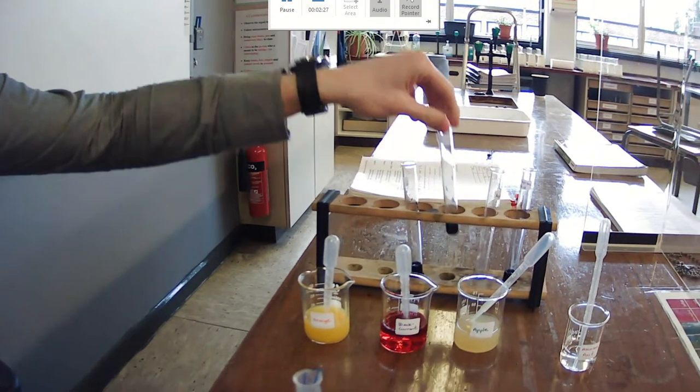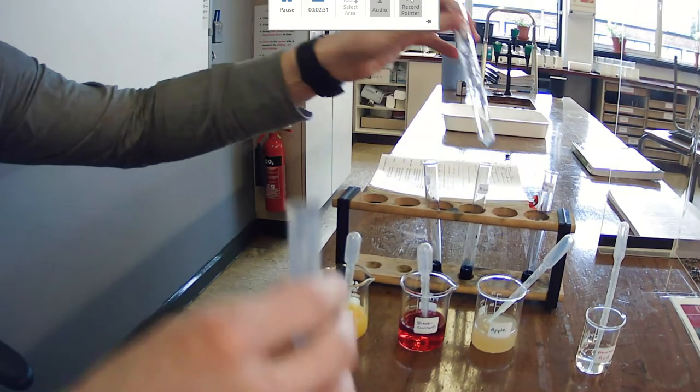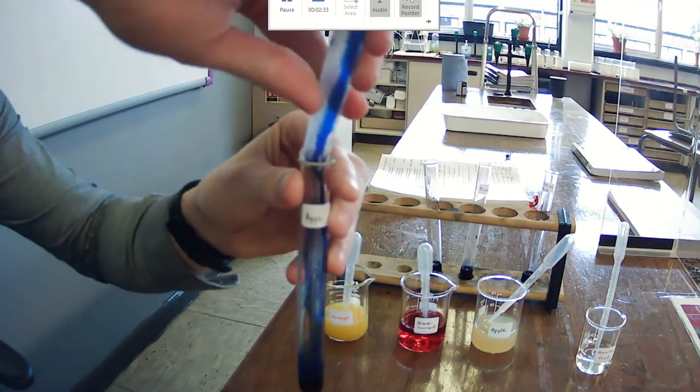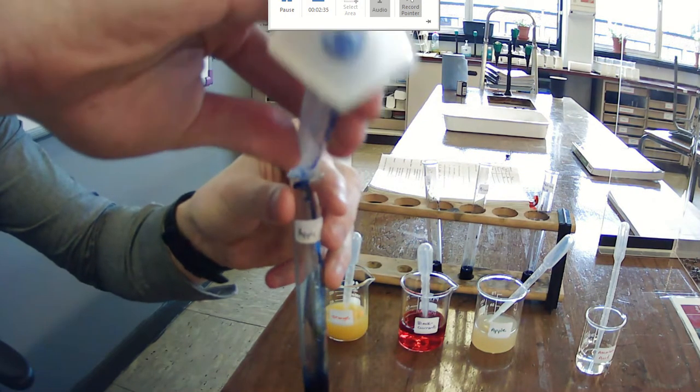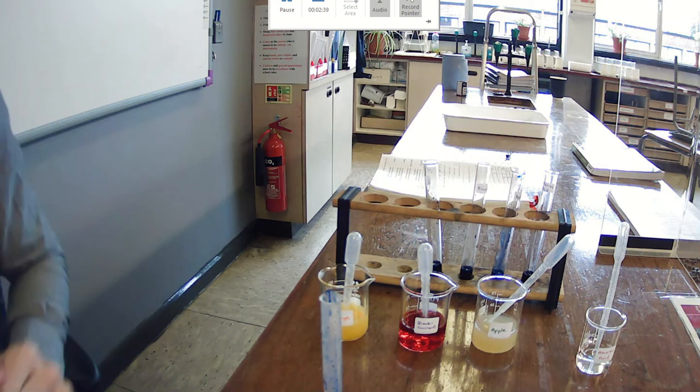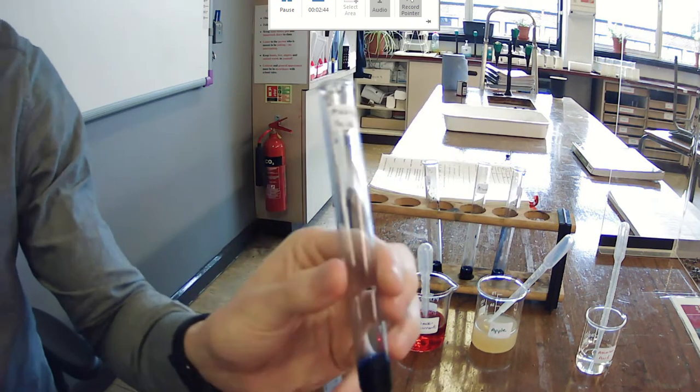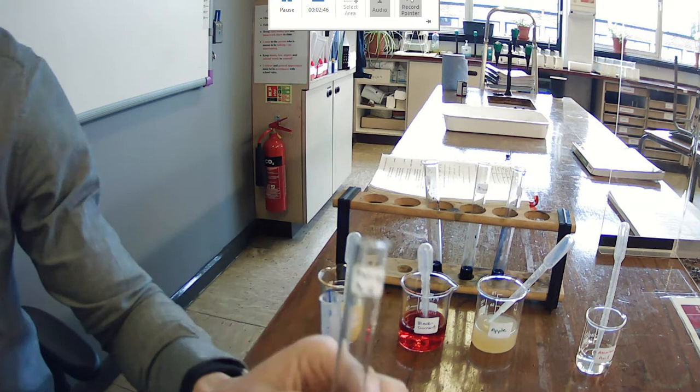Now we already have three test tubes filled with DCPIP, so we've just got one more to fill up. And then we can start our experiment. So four test tubes, we choose one to start with, which is ascorbic acid, as this is pure vitamin C.